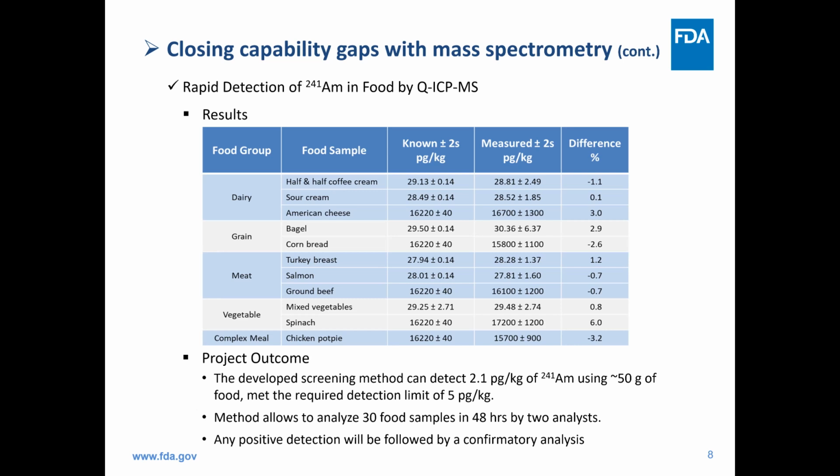We found that 30 samples can be analyzed by 2 analysts within 48 hours, starting from ashing the sample to printing the result at the end.